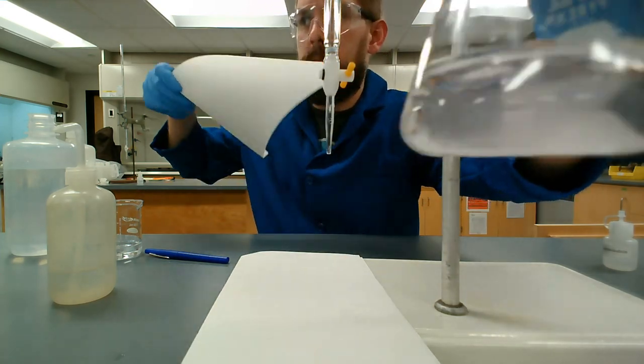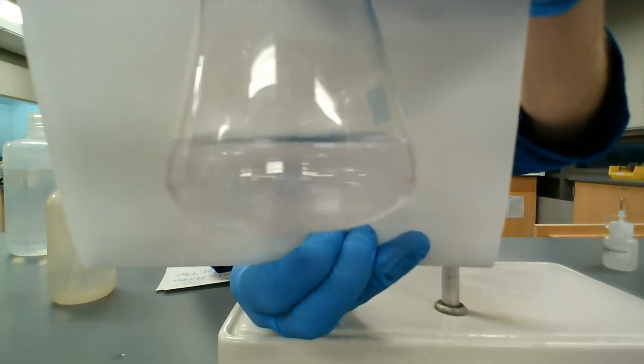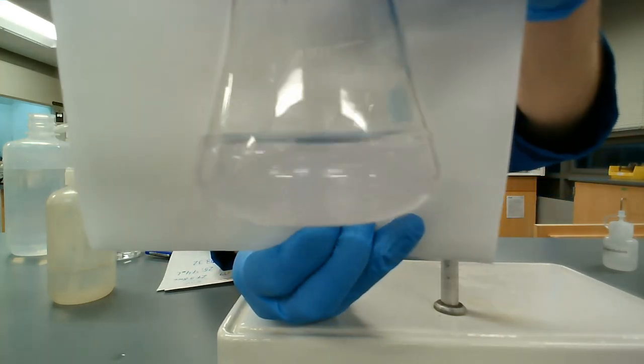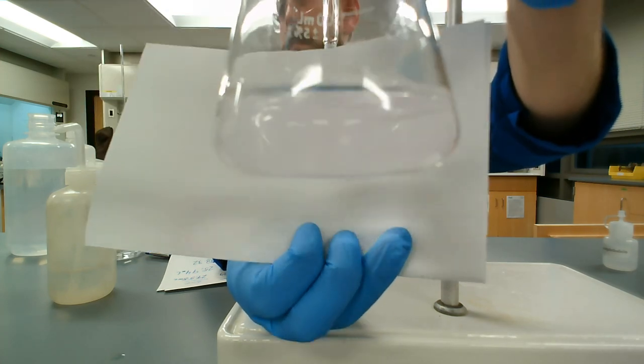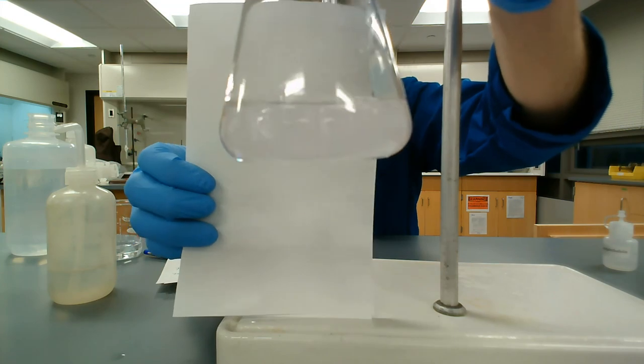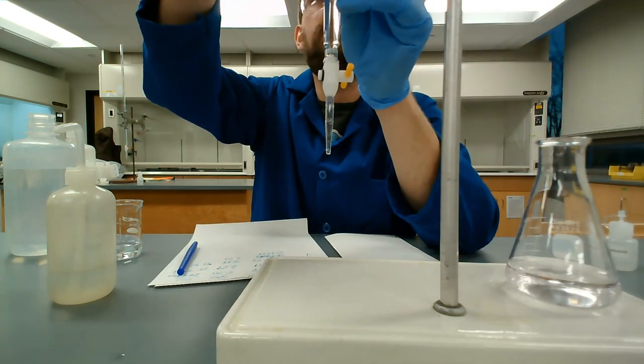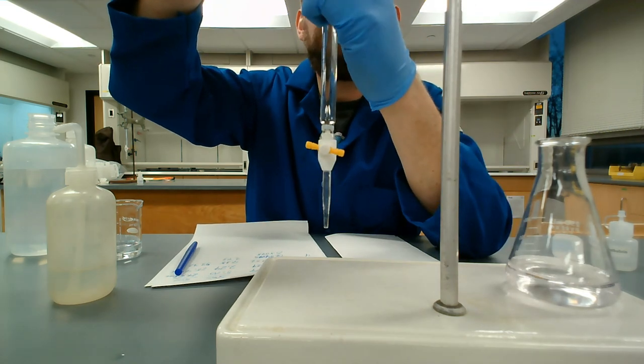But right, these are the steps in a titration. You should go really fast at the beginning and then slow as you see pink start to show up, right? But both hands are involved. All of my focus should be on what's happening in the Erlenmeyer flask. Is the color starting to show up, right? So this was 4 decent titrations.